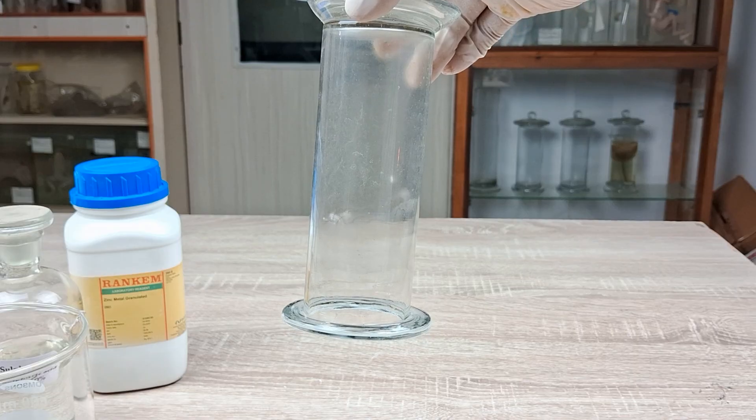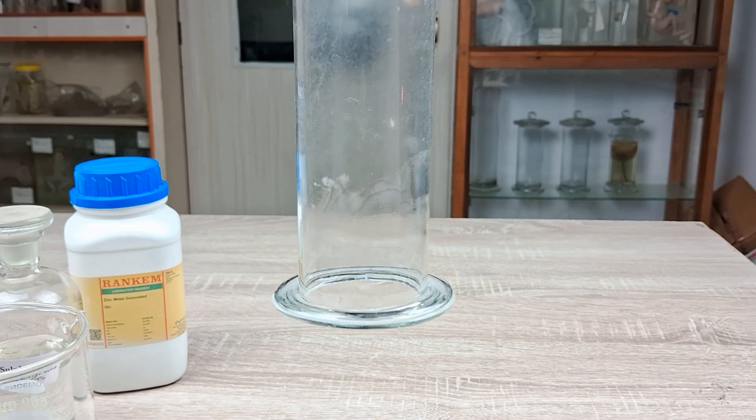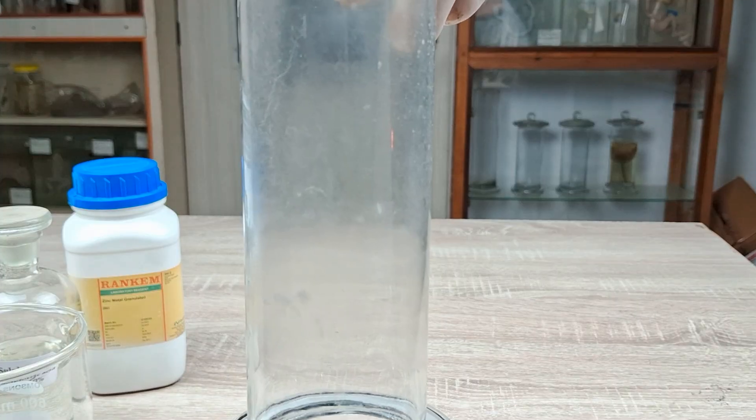Once the gas inside the jar had completely burned, you can see a hazy layer of condensation forming on the inner walls of the jar.